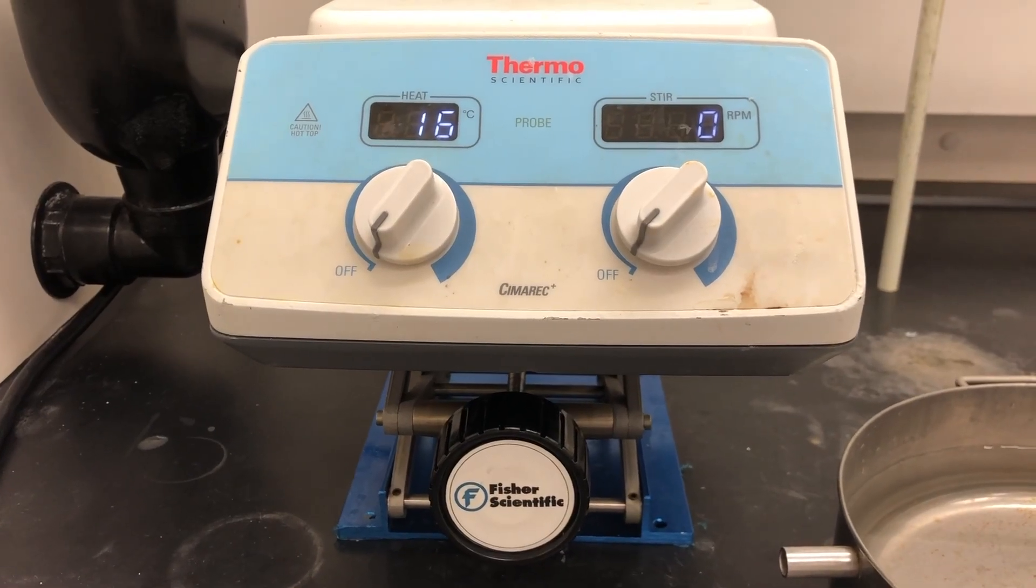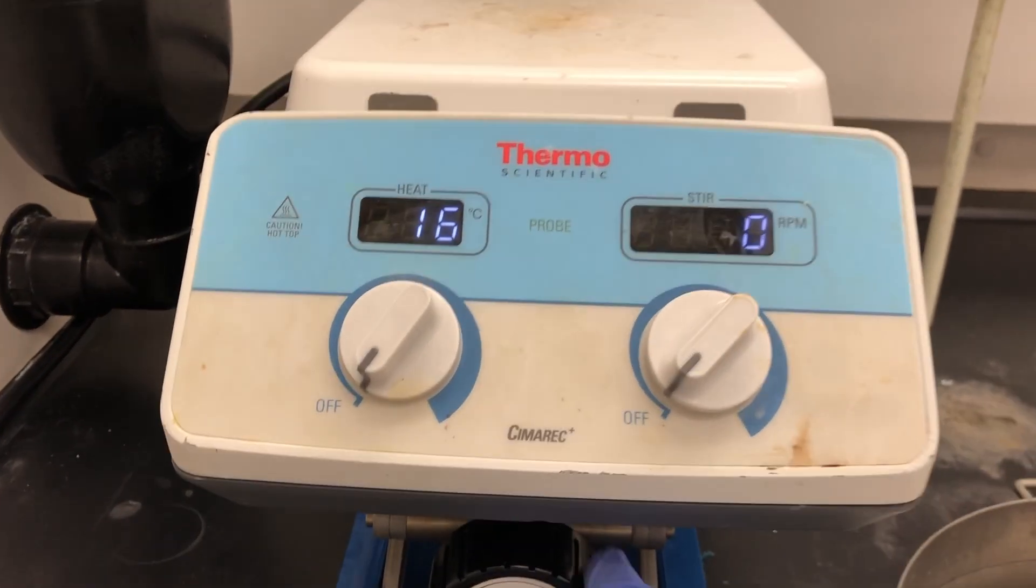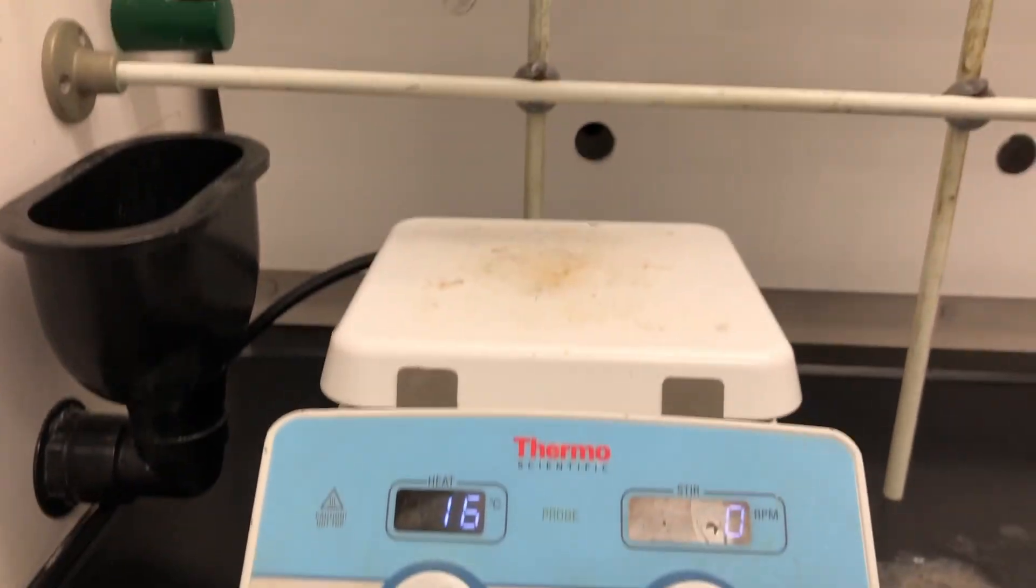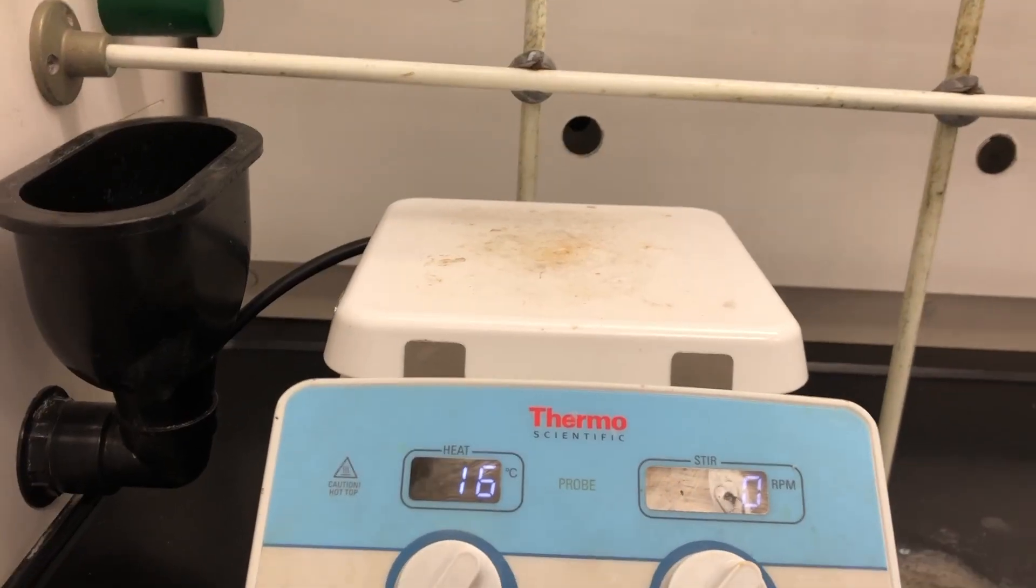Okay, so what we'll need to do is set up a hot plate on the jack. The idea of the jack is that we can lower it anytime we need to remove the reaction mixture from the water bath.